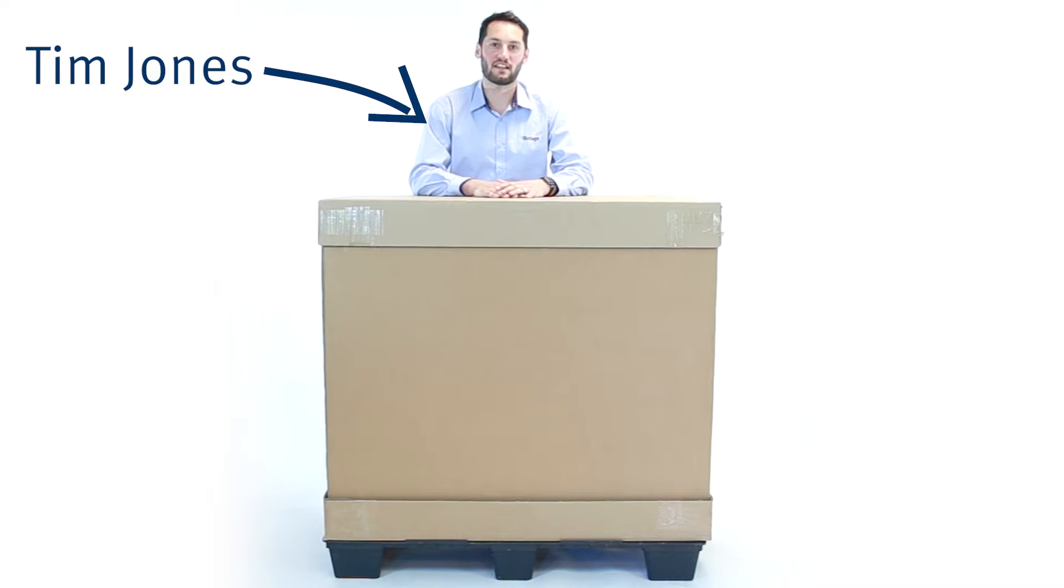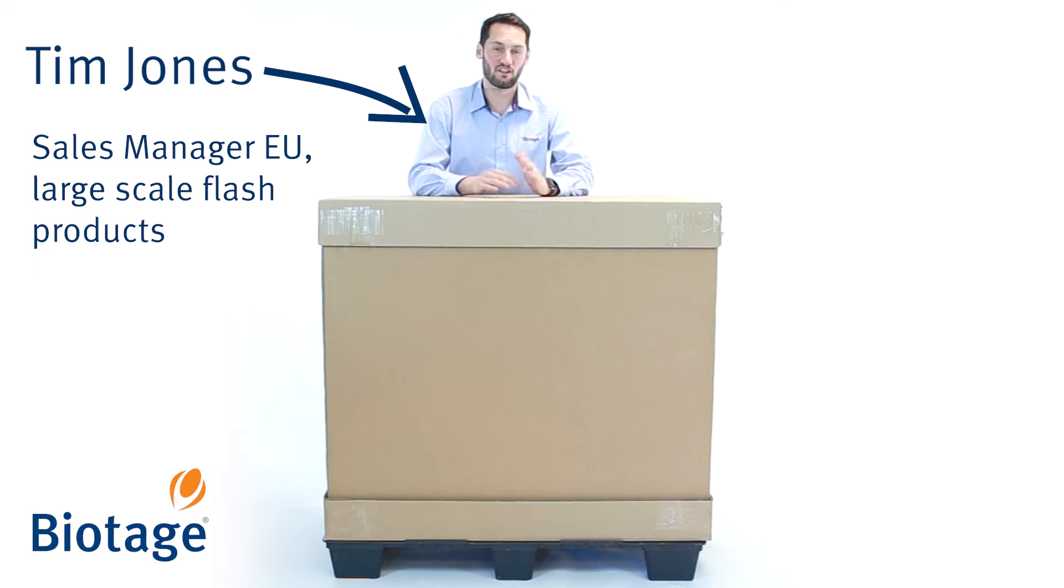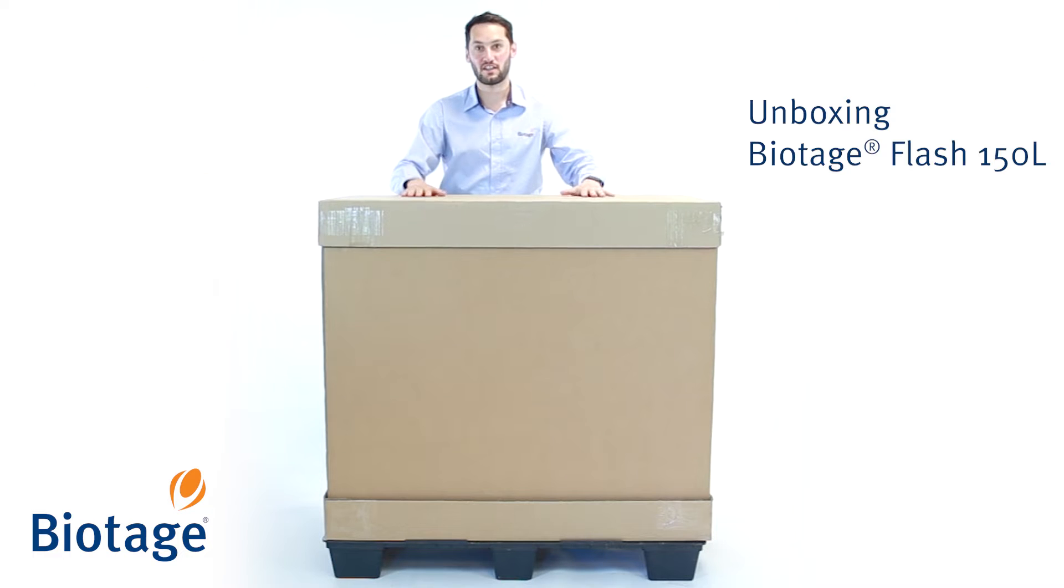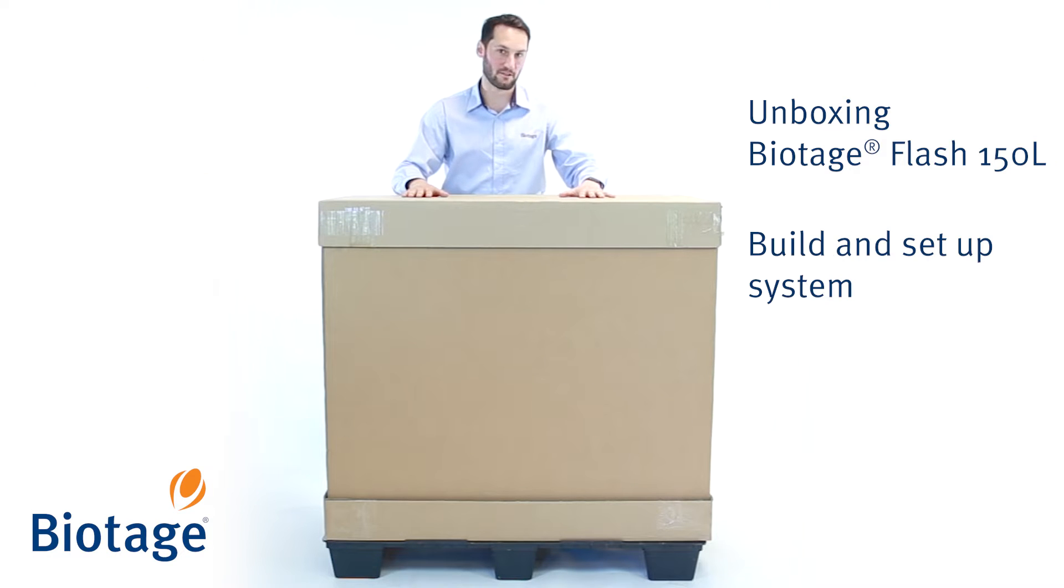Hi, I'm Tim Jones. I'm the sales manager for Biotage looking after the large-scale flash purification equipment. We're going to go through an unboxing of a Flash 150 and show you how to build and set up the system.